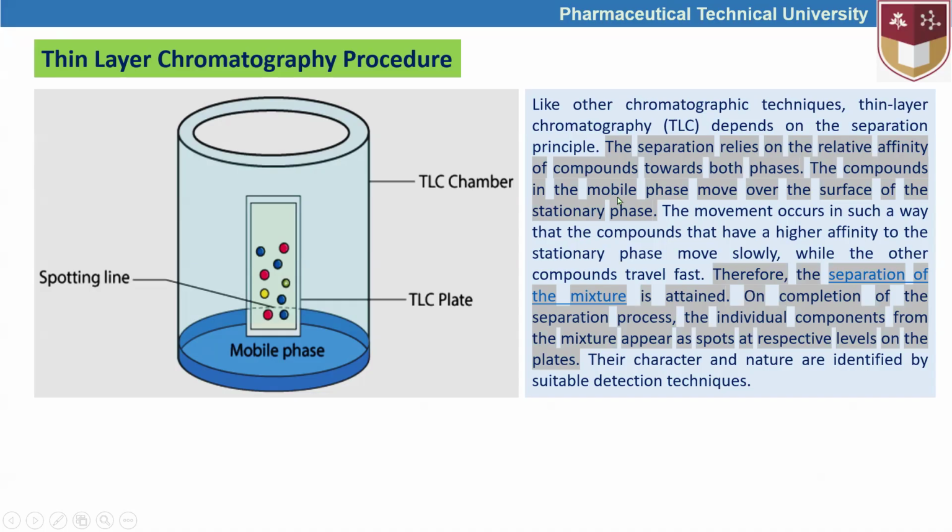The compounds in the mobile phase move over the surface of the stationary phase. As indicated here, the mobile phase is located at the bottom of the glass.